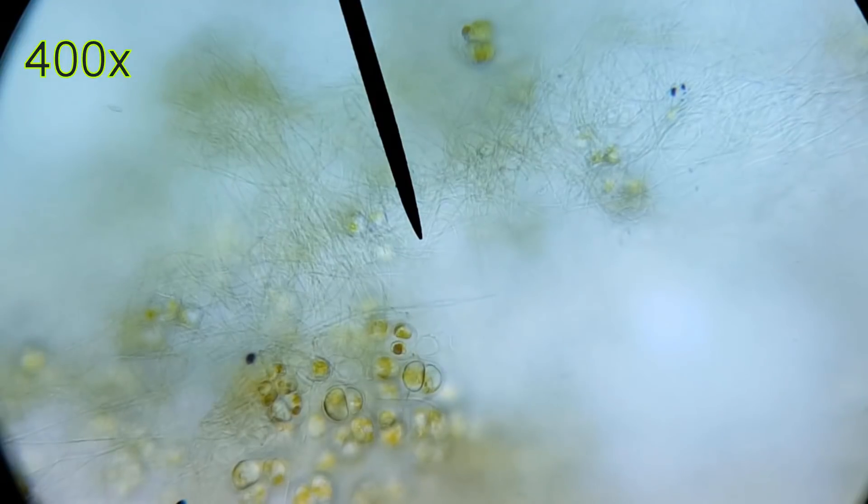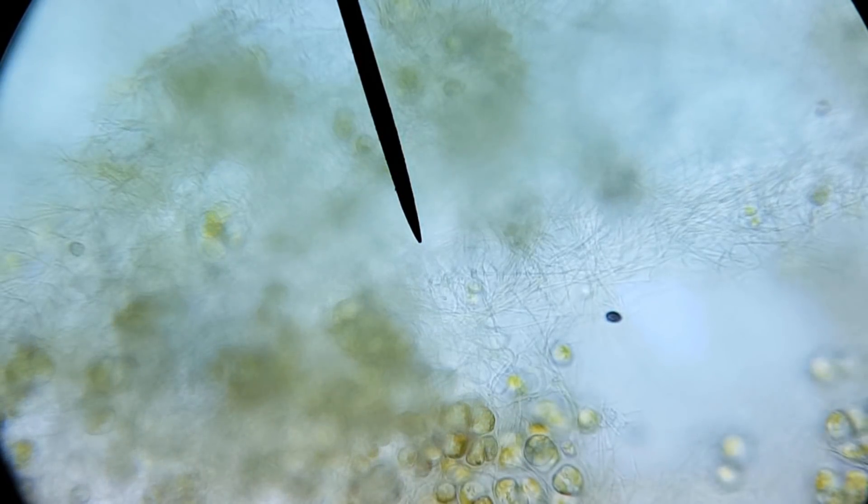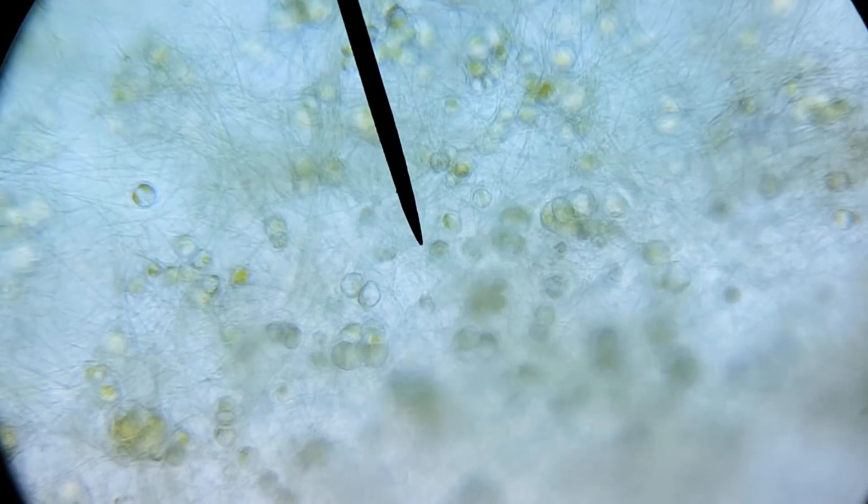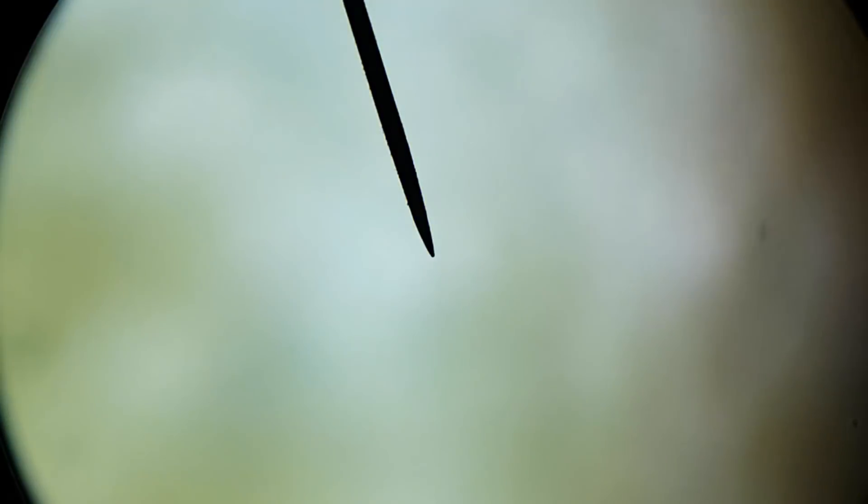Oh no. At this magnification, you can clearly see green cells. They're algae cells. I'm kind of ashamed that I don't really know enough about microscopic life to tell you guys a coherent story, but I am learning.